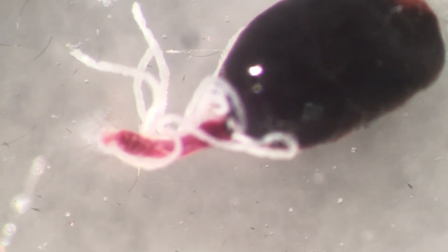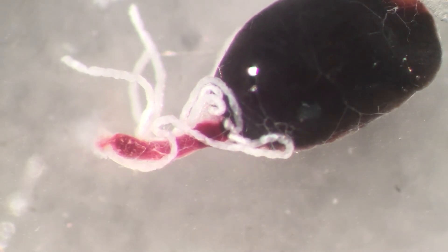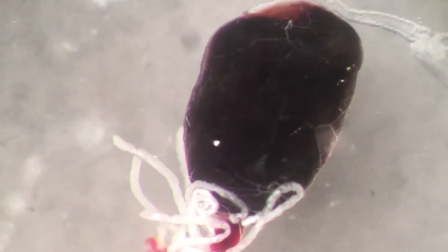These white structures here are called Malpighian tubules. Let me use the needle to untangle them a bit. It's not the tubules that are moving into the gut - that is actually peristalsis. The Malpighian tubules - they are the equivalent in insects to our kidneys.